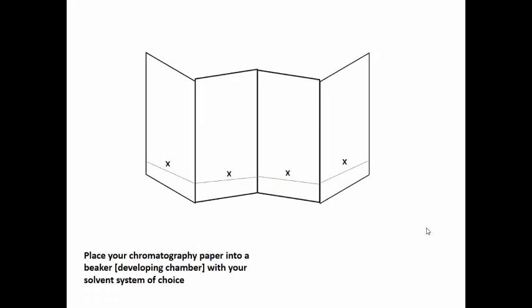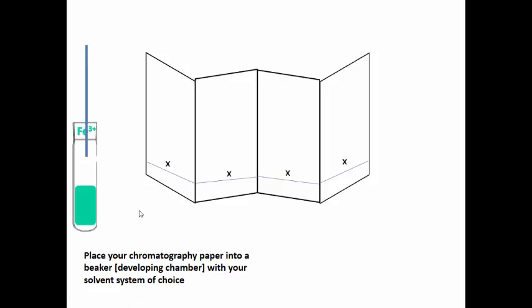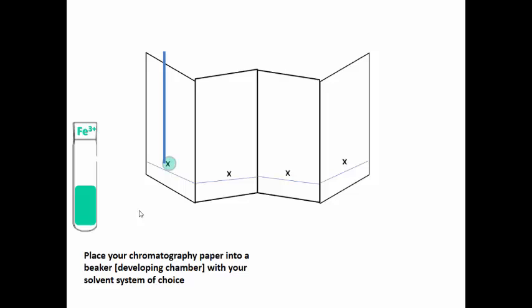I've prepared my chromatography paper. I have an X here in each panel, just like the lab manual instructs us to do, and I have a line one centimeter from the bottom of each panel of chromatography paper. So now here's my iron. I'm going to spot that onto the chromatography paper. I dip the capillary in, bring that over, and I spot it on the X.